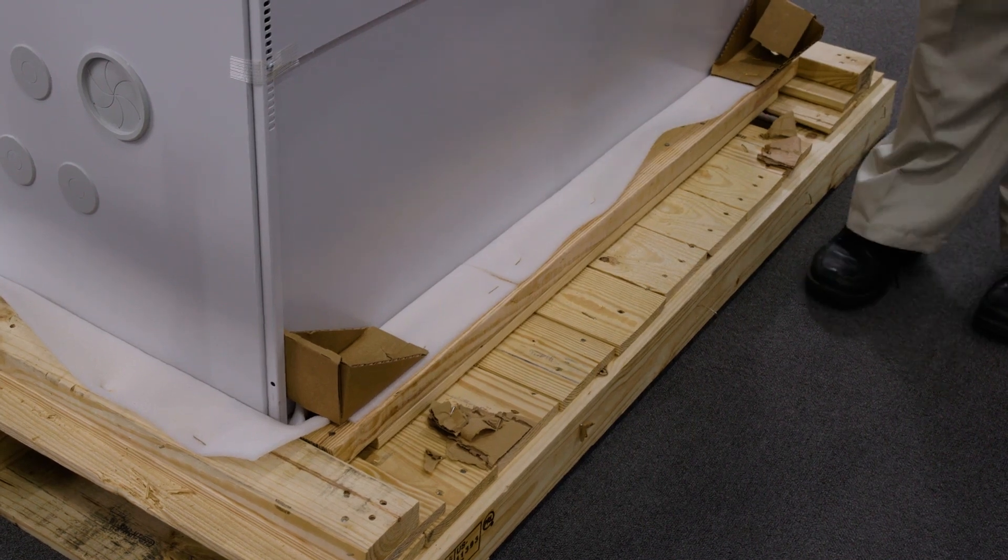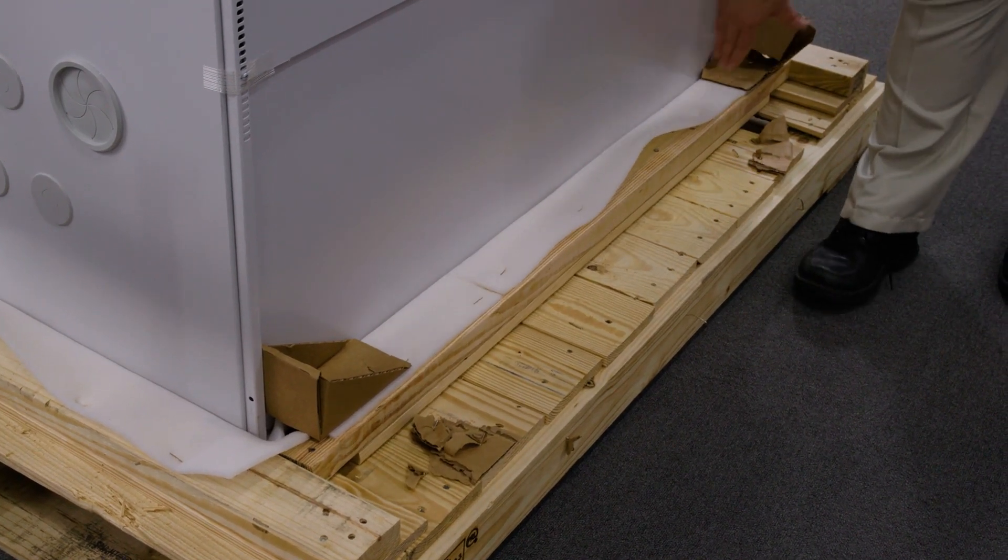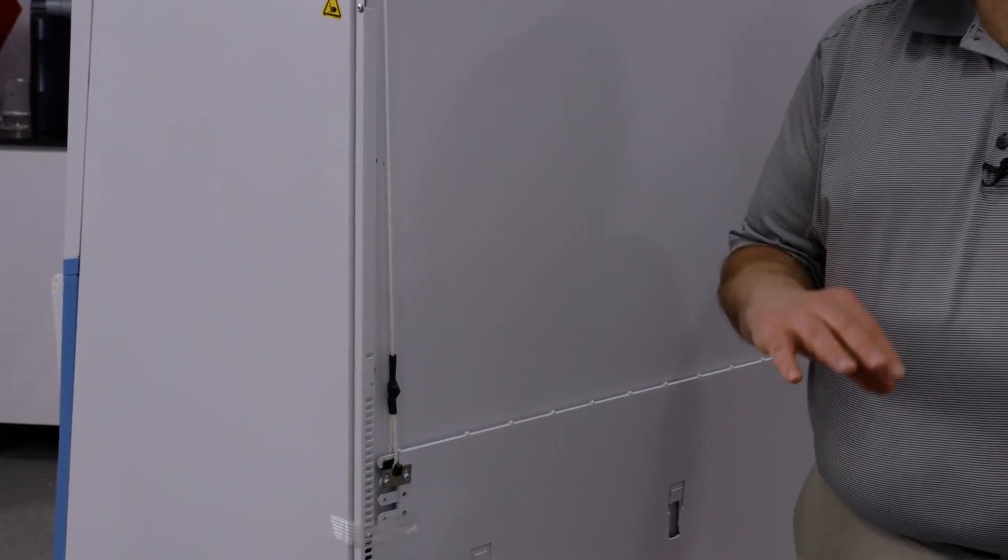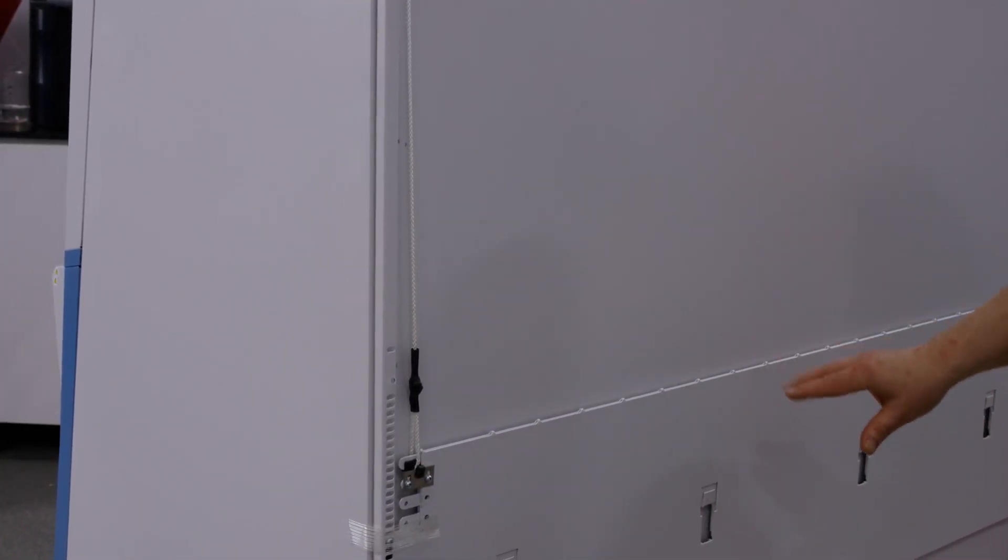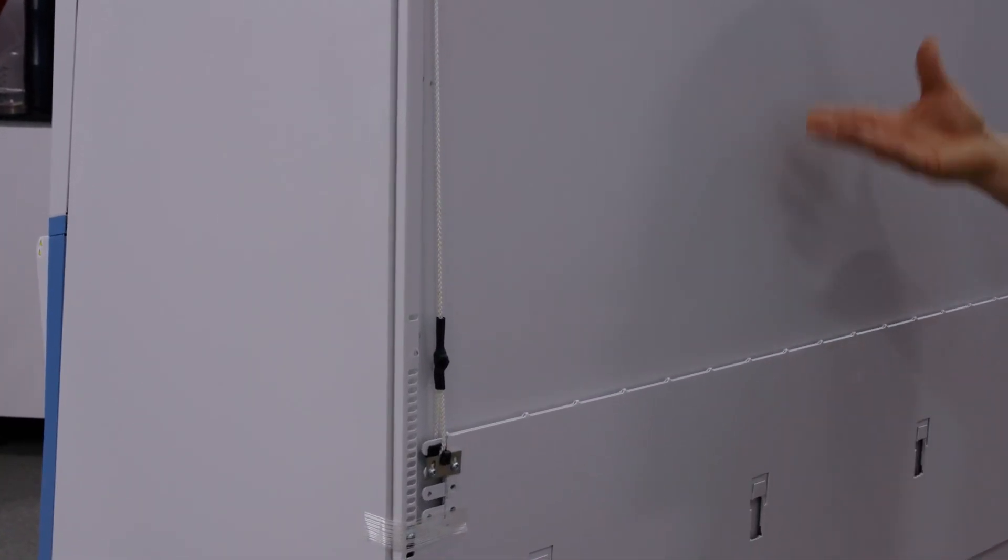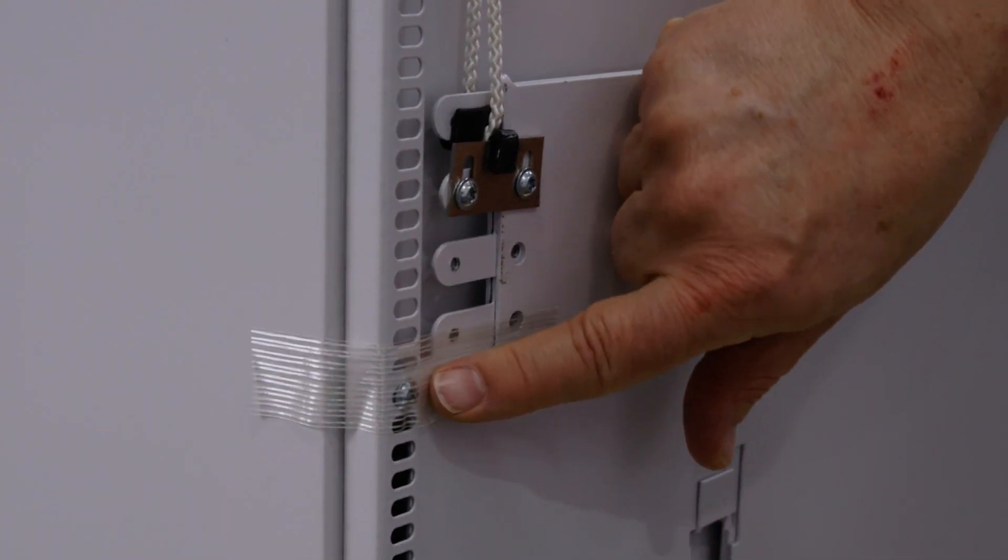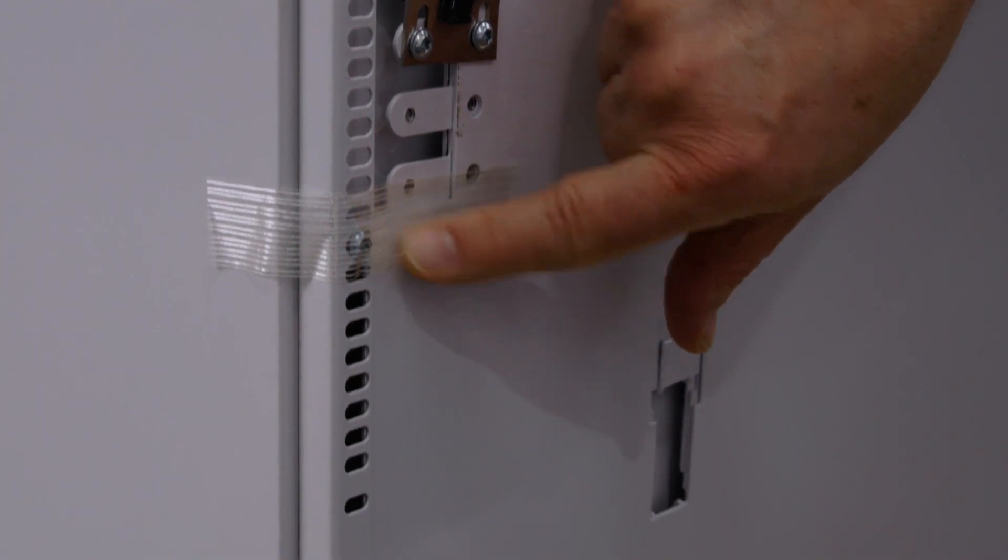One of the things you should think about is on the back of the unit, we have this counterweight to allow for the easy movement of the window up and down, and for shipping, it's secured at four locations, two on one side, two on the other.